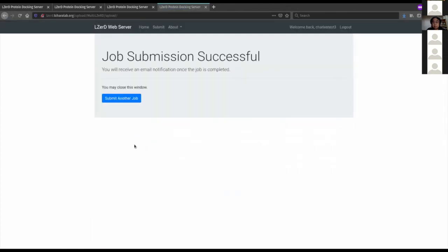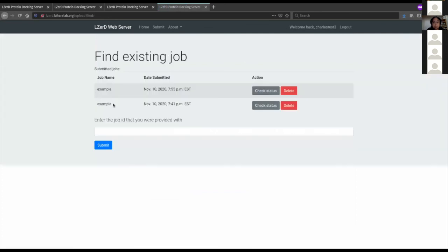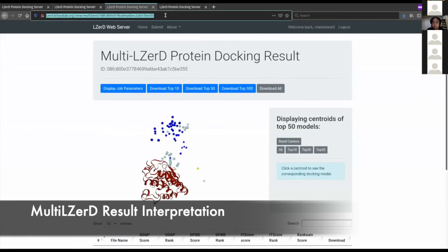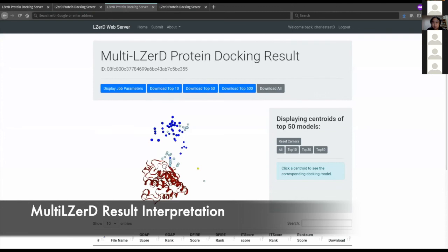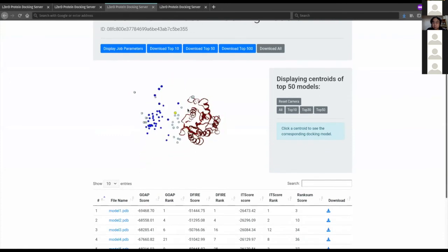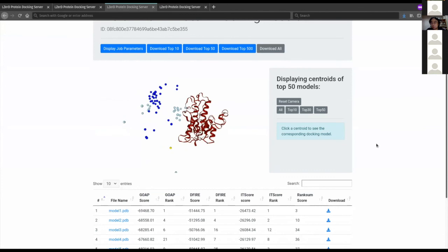Unlike with pairwise LIZARD, Multi-LIZARD can't take advantage of caching to speed up job return because the genetic algorithm stage is a stochastic process and the point of it is destroyed if results are cached. I have prepared a pre-computed example which I've put in the Zoom chat — you can open that URL to follow along.